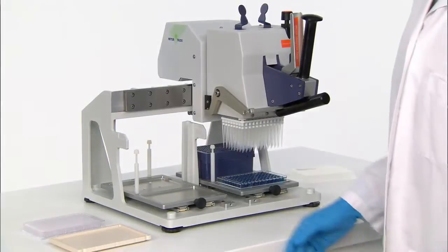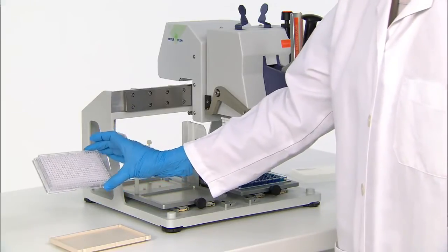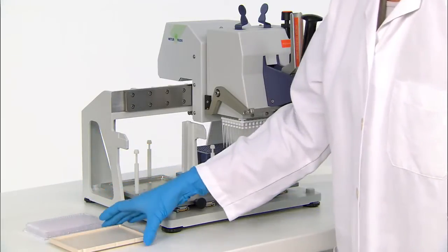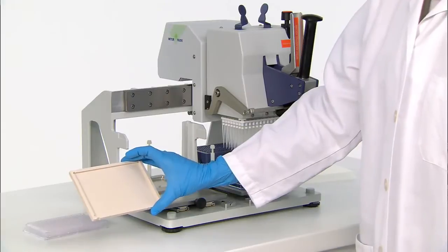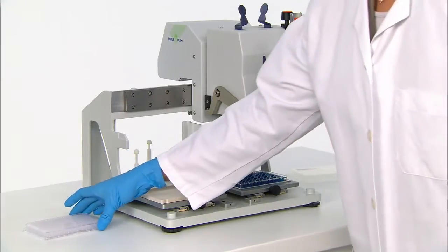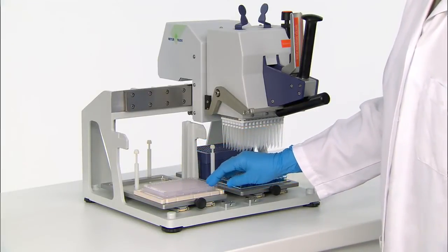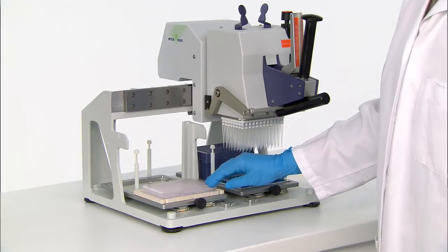The Liquidator 96 can also transfer liquids to a 384-well plate. A height adapter plate brings the 384-well plate up to the right level for optimum performance. This adapter allows the plate to move to all four corners so that all 384 wells are filled properly.